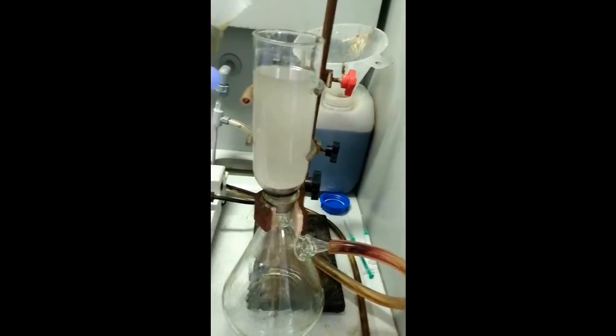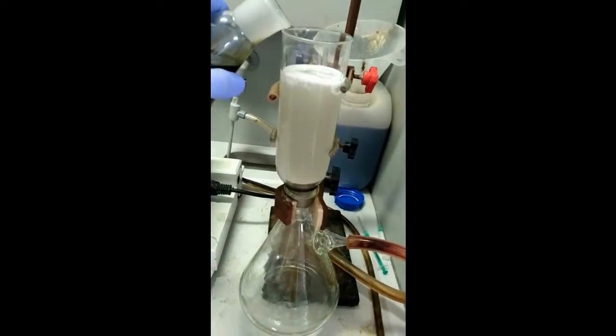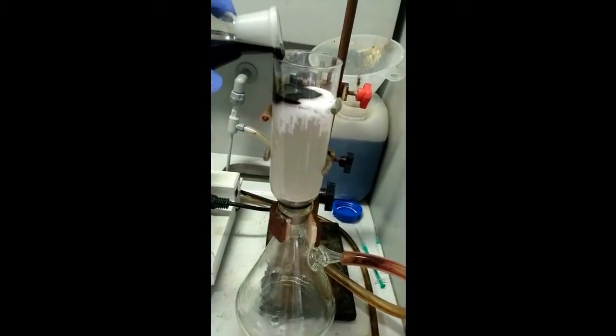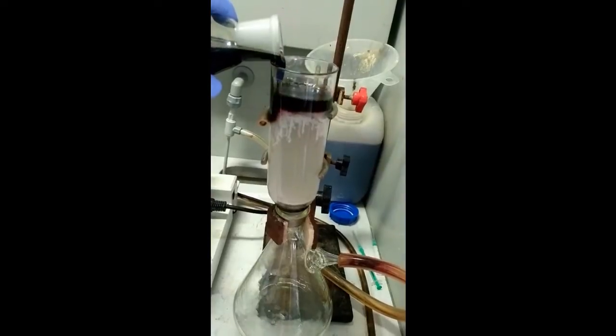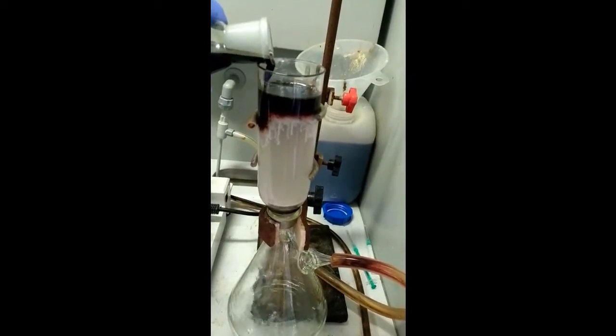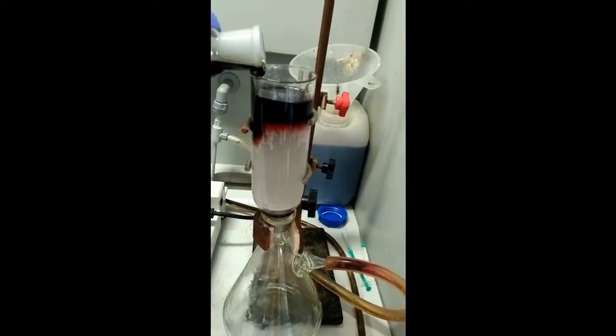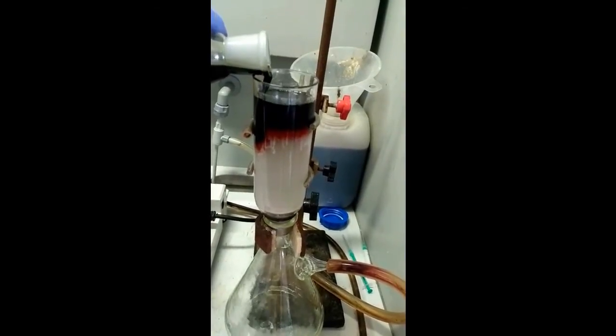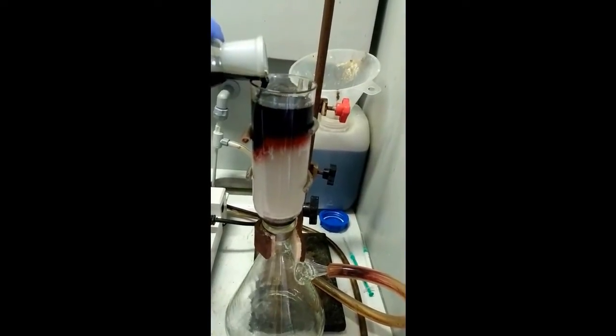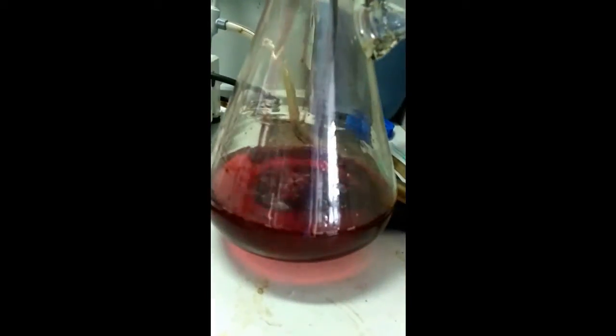The reaction is purified using silica gel plug with dichloromethane as an eluent. As you can see, the greenish mixture contains reddish porphyrin. You can see it now.